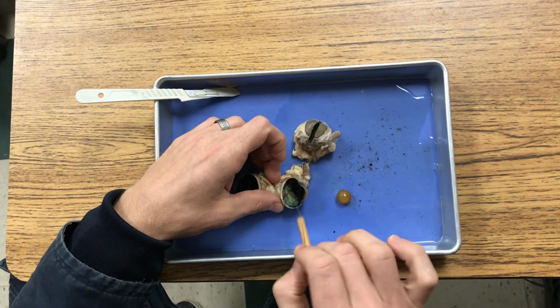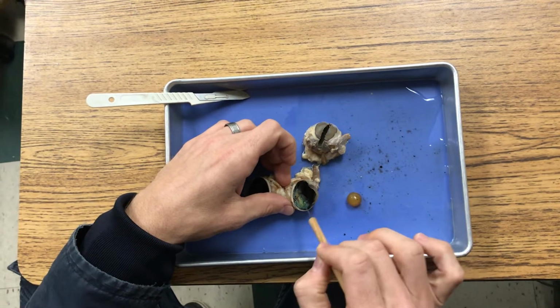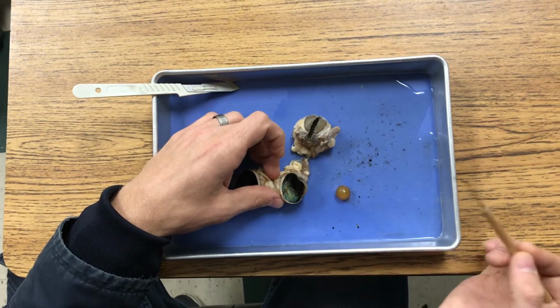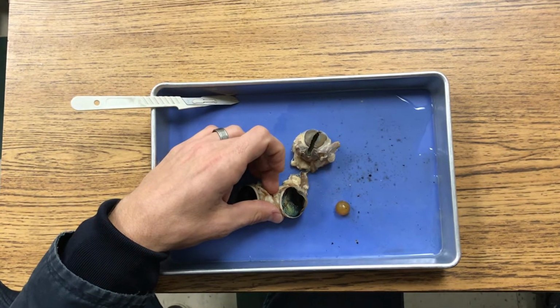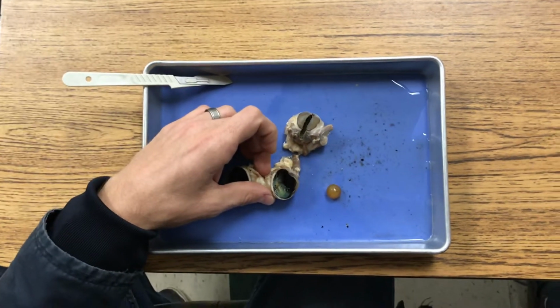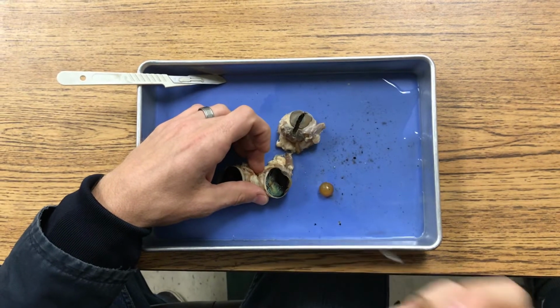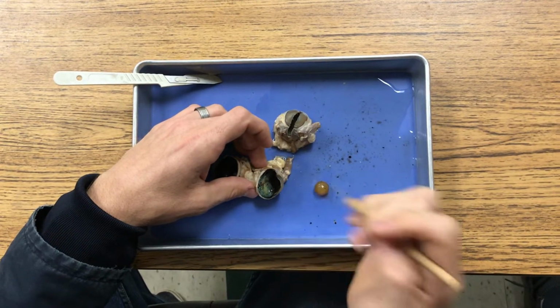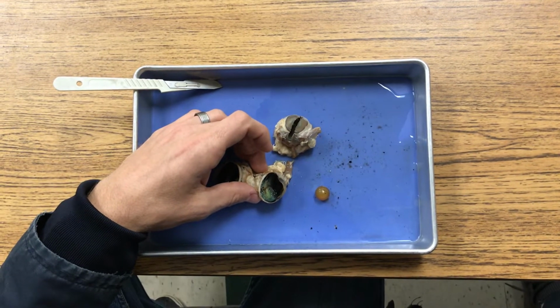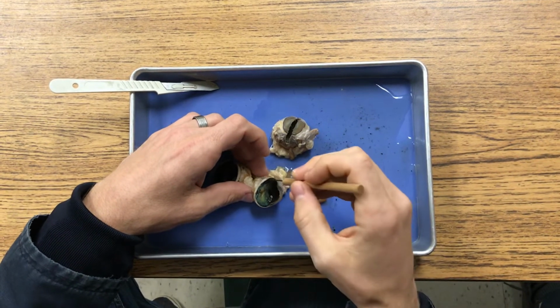So this is why your pets have this too. So cats and dogs have this, and it allows them to see better at night. And if you shine a flashlight in your pet's eyes, you'll see reflection back. That's because they have this layer. But we don't have it. So if you shine a flashlight in your brother's eye, it doesn't have the same effect, okay?